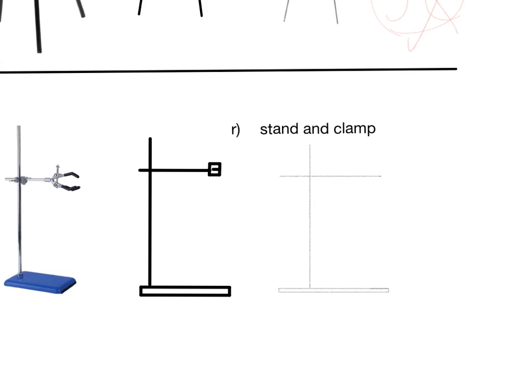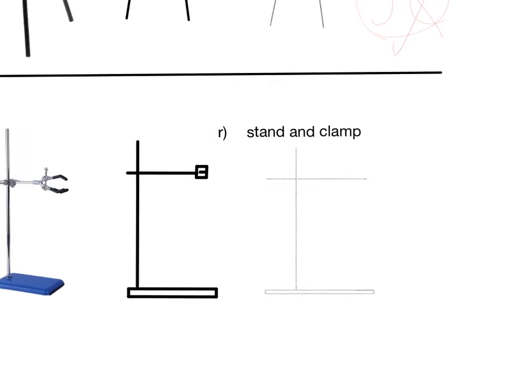And then the clip. I think it's very difficult to tell because it depends on what you are going to clip. It really depends, so very hard to draw. But anyway, this is a stand and clamp.